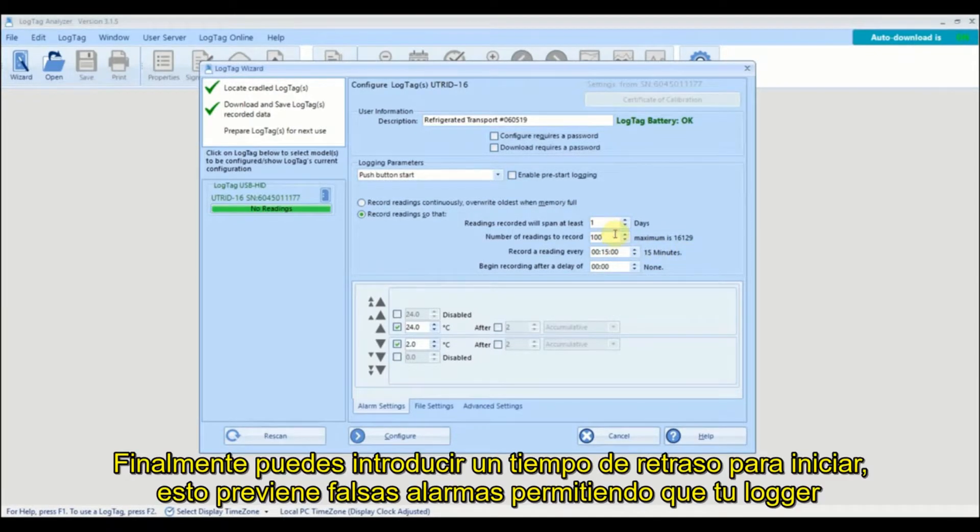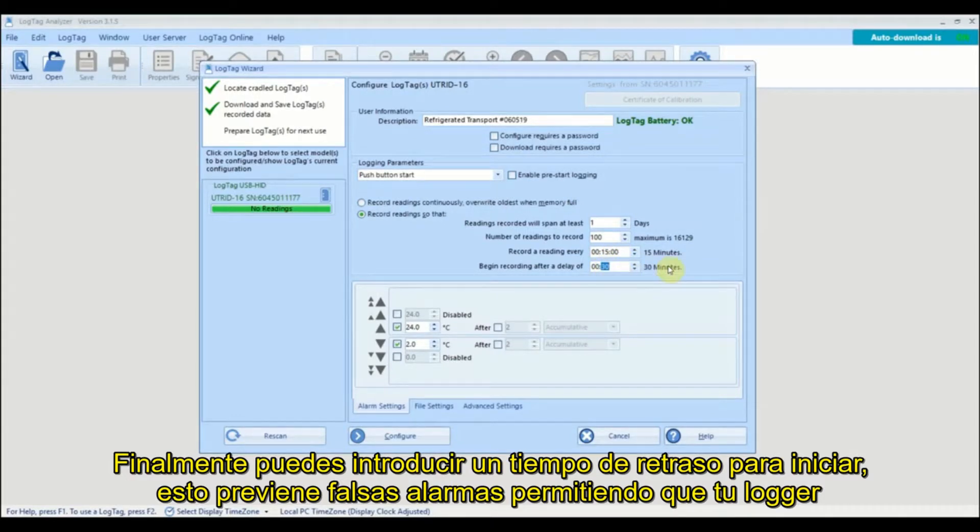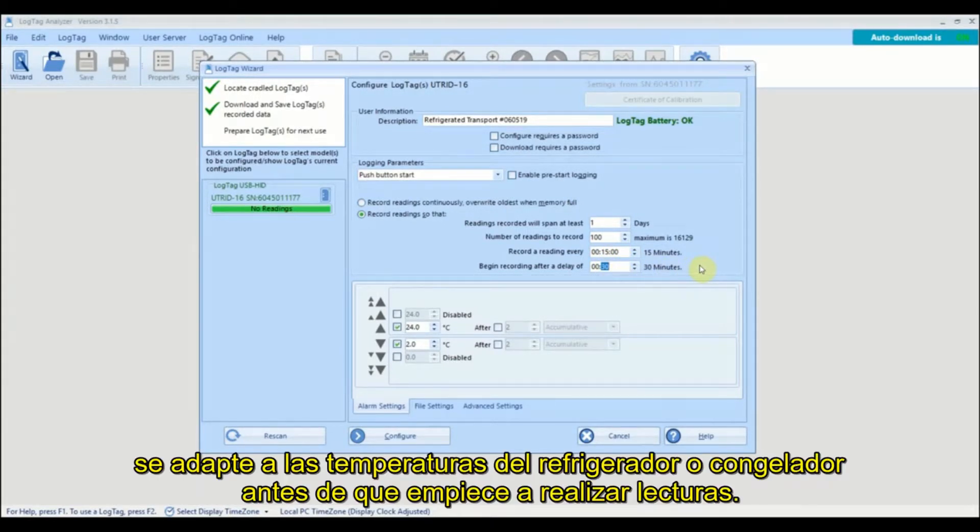You can enter in a start delay. Adding a start delay prevents false alarms by allowing your logger to adjust to the refrigerator or freezer temperature before recording starts.